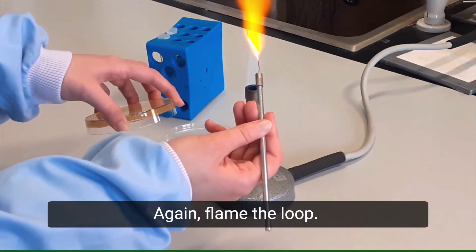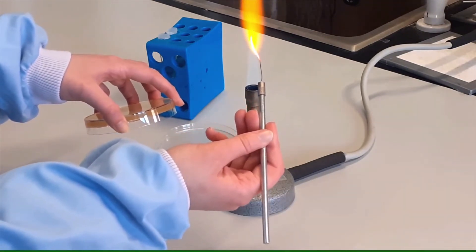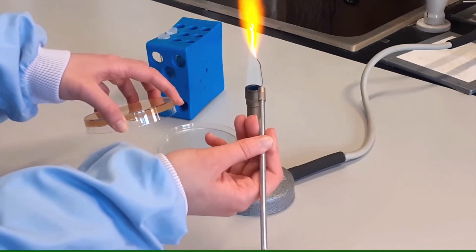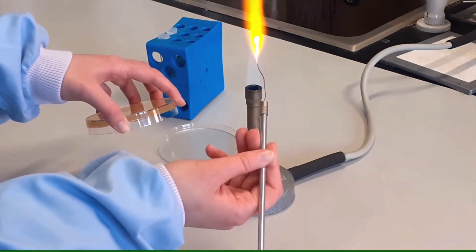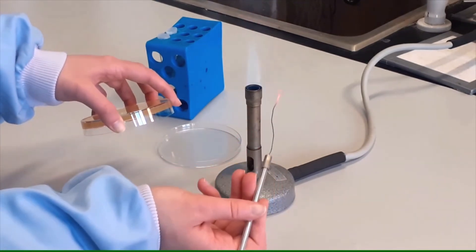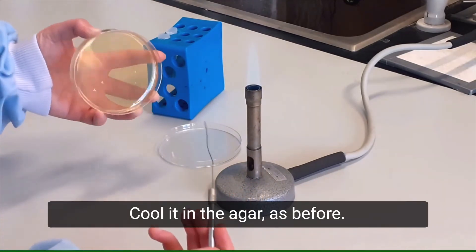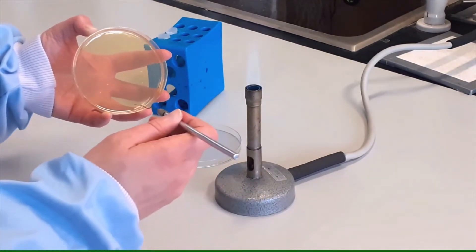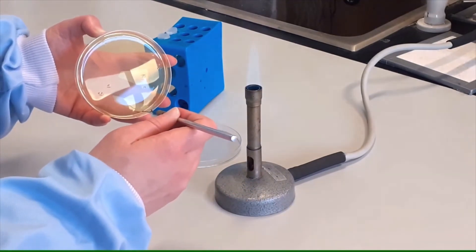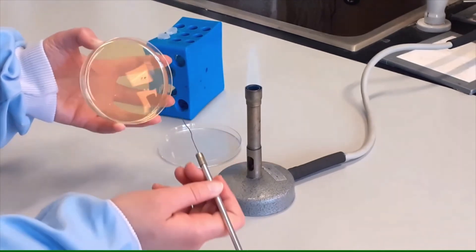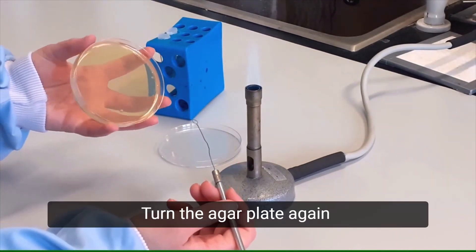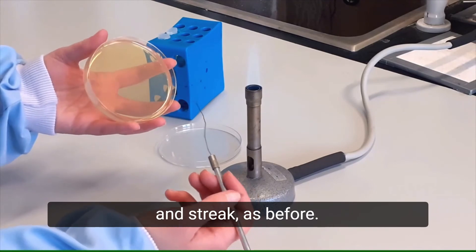Again flame the loop. Cool it in the agar as before. Turn the agar plate again and streak as before.